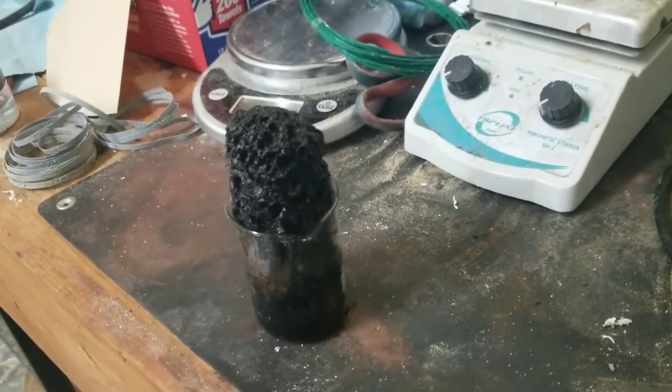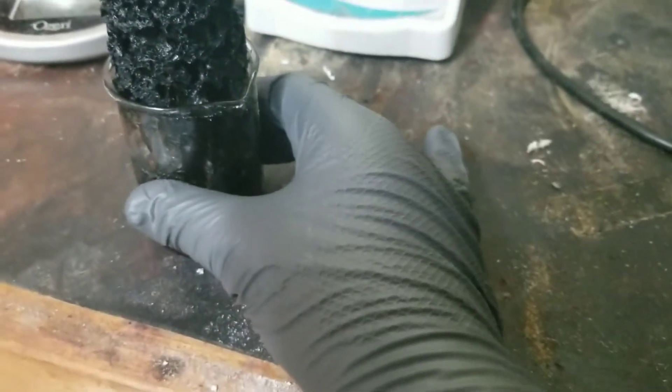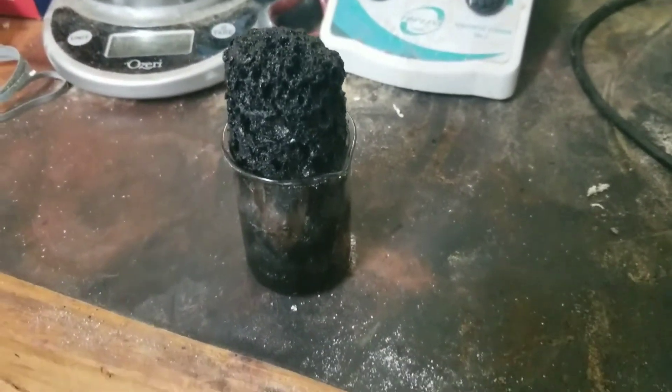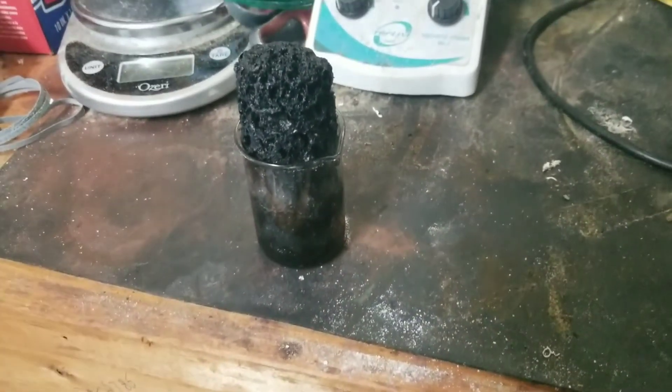It gets really hot when that happens — oh wow, yeah, it's hot to the touch. So that was the reaction between sugar and sulfuric acid. Hope you enjoyed!